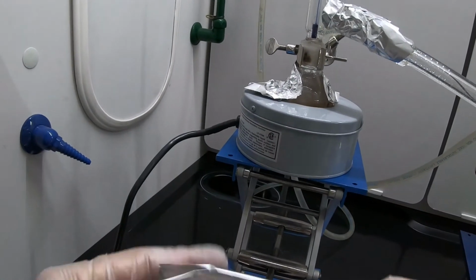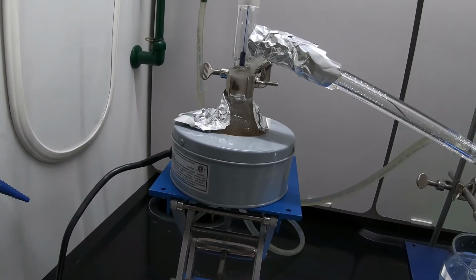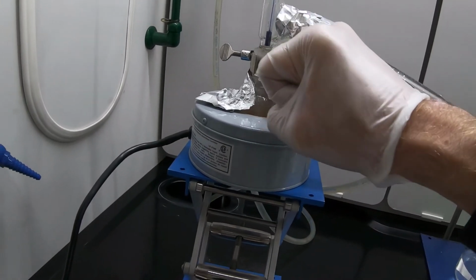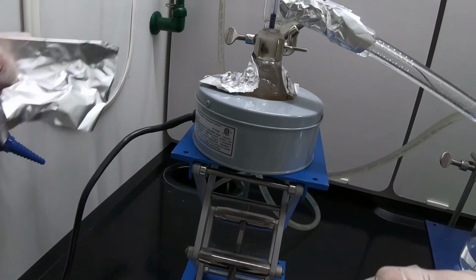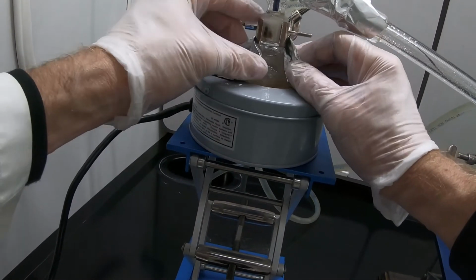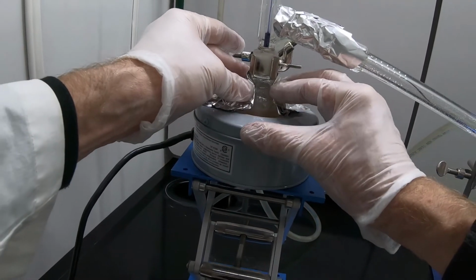Maybe if I'm clever, we can keep a little window to see what's happening. Again, ordinarily I would wrap this entire vessel with tin foil, but for observation of the temperature and watching vapor collect on the bottom of the thermometer, I'm only going to do part of that, all right?